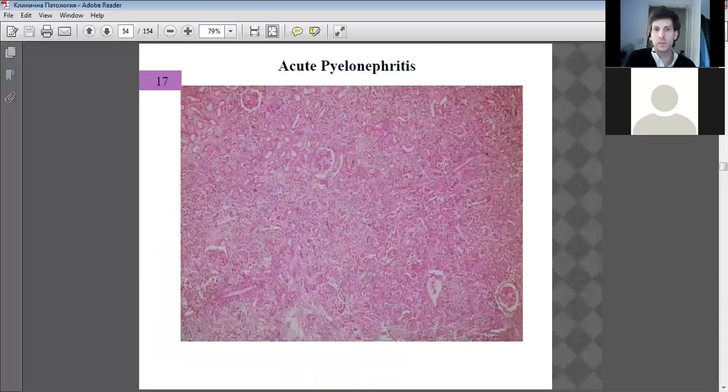Eventually, this kidney will become non-functional. Nephritis, pyelonephritis. The problem with this is that it can cause damage to the glomeruli. Acute can be treated if done in time, but generally these glomeruli start to become inflamed, and as they become inflamed, eventually their membranes are disrupted and can cause some collapse of their structures.